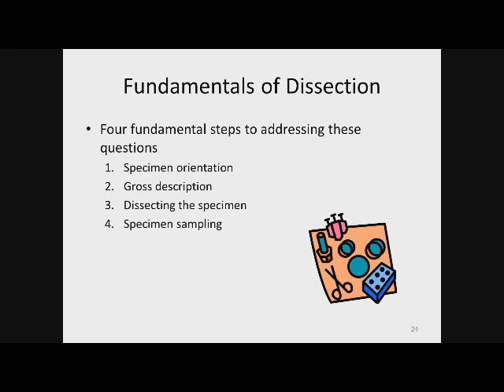The first one is specimen orientation, essentially making sure that the specimen itself is in anatomic position as if we were looking down at the table at the patient. Specimen orientation is critical with larger specimens because we oftentimes need to mark the margins, medial versus lateral, superior versus inferior, deep specimens. All of those terms come into play with specimen orientation. If the pathologic process goes beyond the borders, we want to know exactly which borders they go beyond so that the surgeon can go back in and remove more of the tissue as needed.